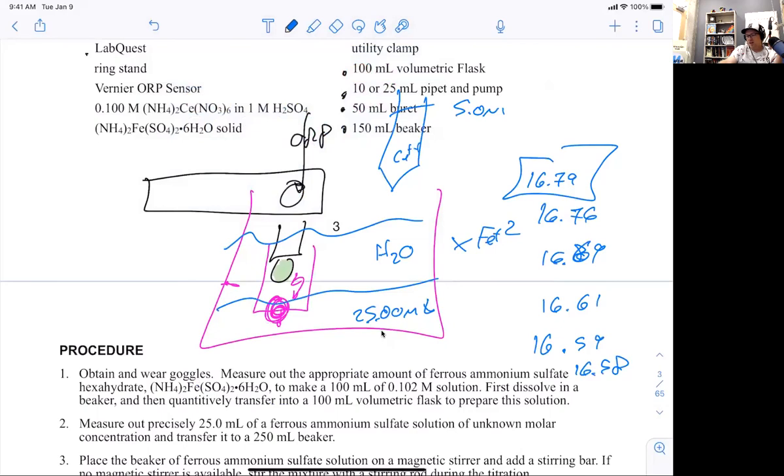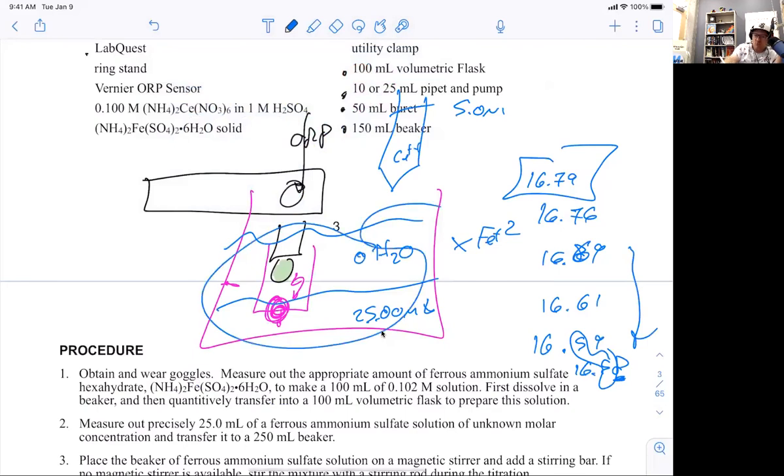I call this drift, and there's a lot of drift in it. And you could spend 90 minutes on your first trial. So don't worry so much about the last sig fig. Once, for about a minute, it's staying pretty constant in the tenths place, hit keep and move on and get more data. Don't hit keep as soon as the solution goes in there. You do have to wait for a minute for this cerium to mix in and react and equilibrate.